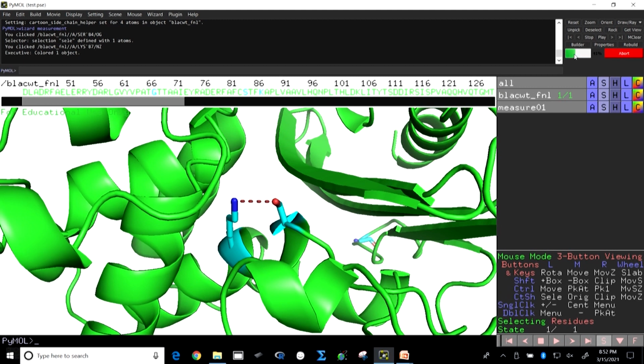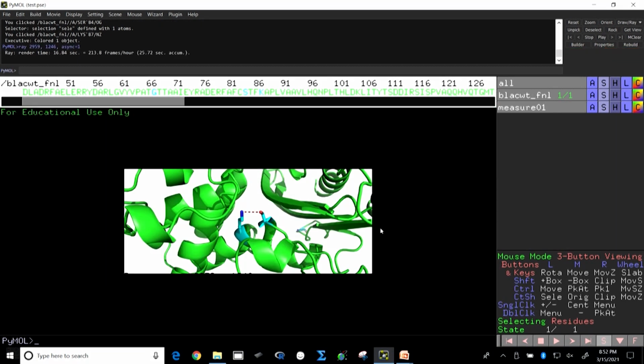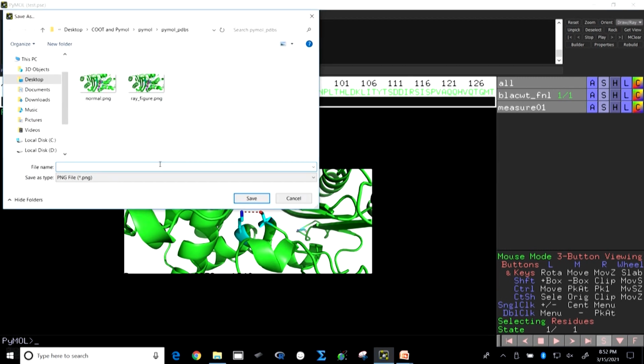See the development of formation of the rendering is happening. Rendering means if you carefully see the screen, the picture is getting sharper at the edges, becoming better. See, now you get this portion, it is already selected the part you want to save. So, you put any name on that and you could save it.